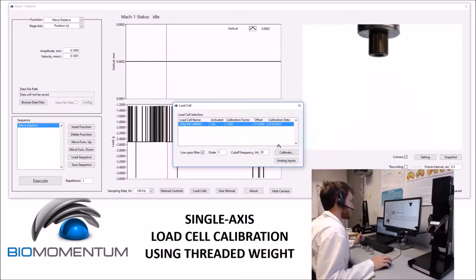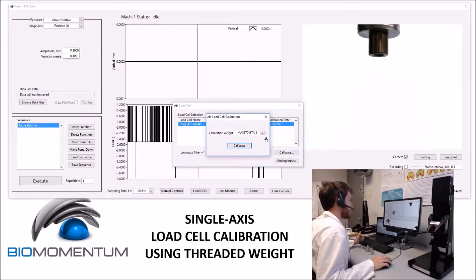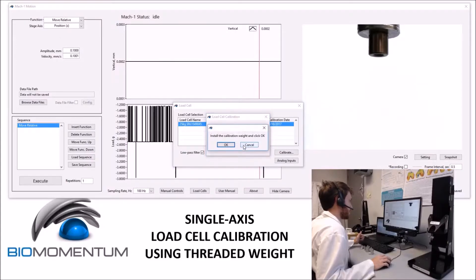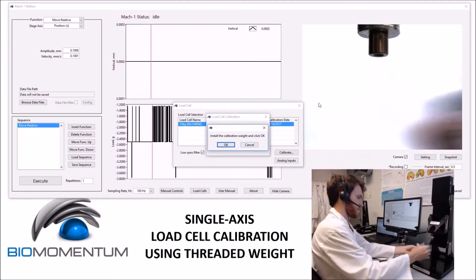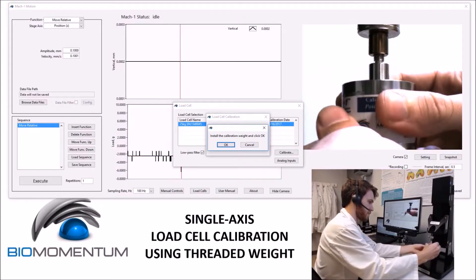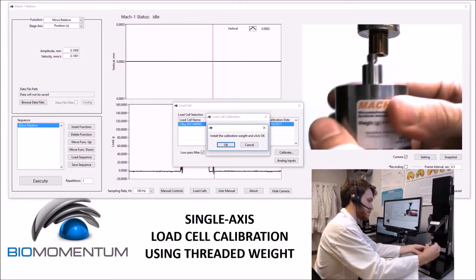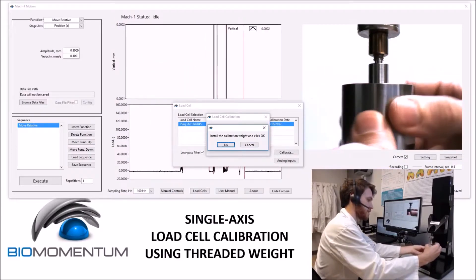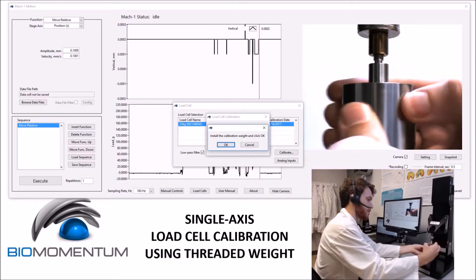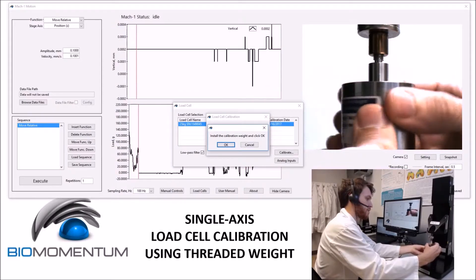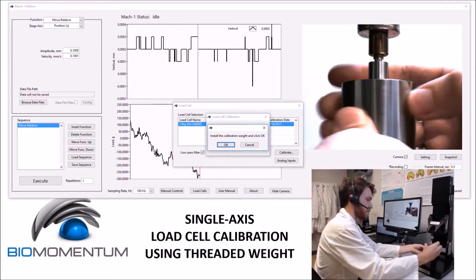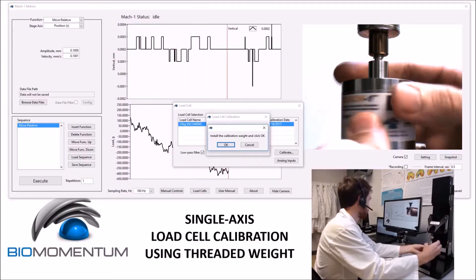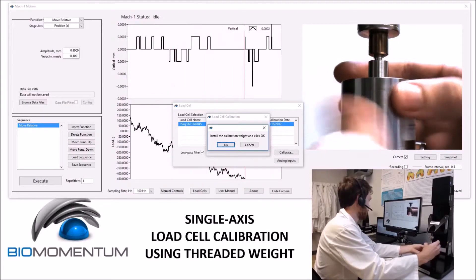The second calibration method is to insert the weight directly into the load cell. For this, I will select the proper calibration weight, click calibrate, and then follow the instructions on screen. Always be careful when installing anything into the load cell. It's sometimes prudent to keep an eye on the load cell window to see how much force you are putting on the load cell currently.